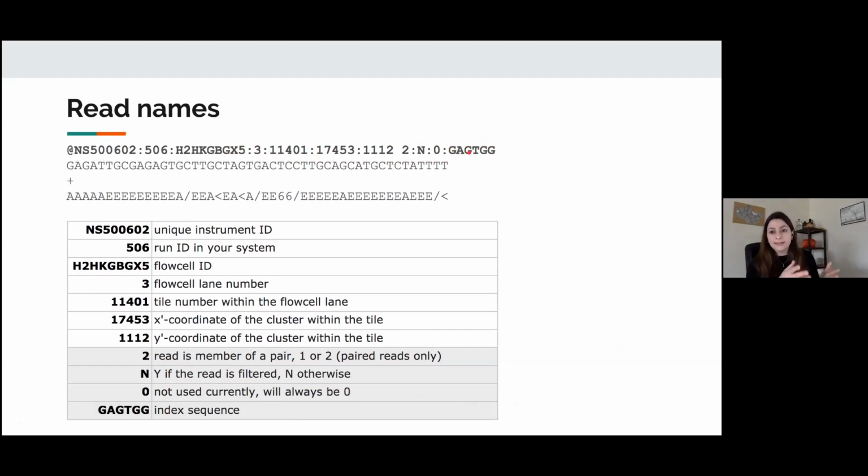So, like I said, there are many reasons all this information can be useful, where you can do quality control or you can do detective work. For example, if you have a file that you downloaded from somewhere and you have multiple sequencing runs in it and some of them don't look so good and the mapping quality is not great, you can do some detective work and figure out, were they all sequenced at the same time? Is it the same library? Should I expect batch effects? That's the most common way you will use this.